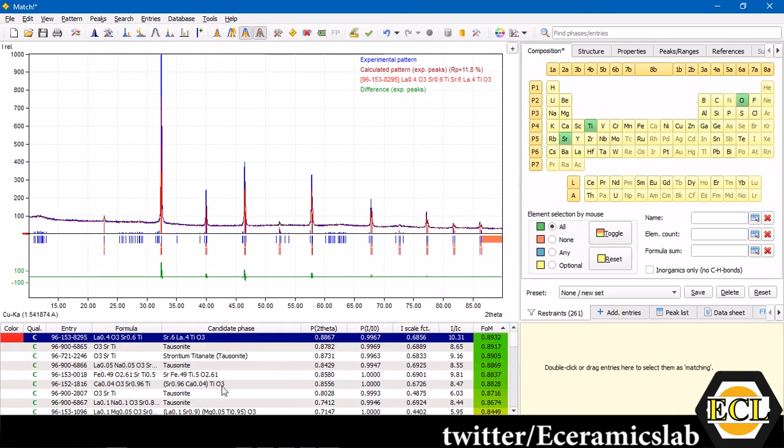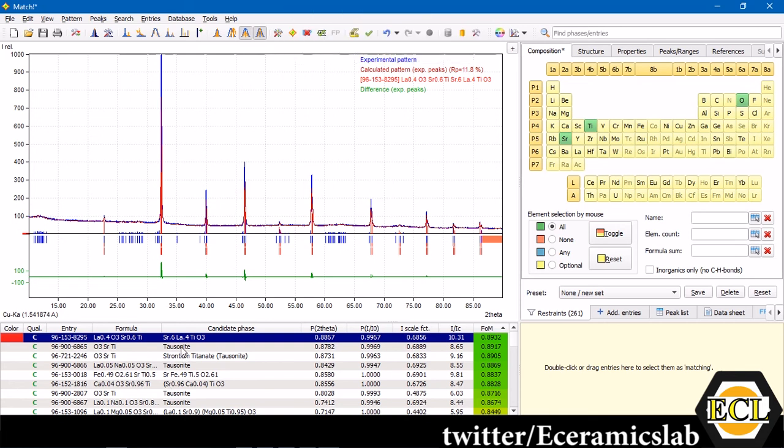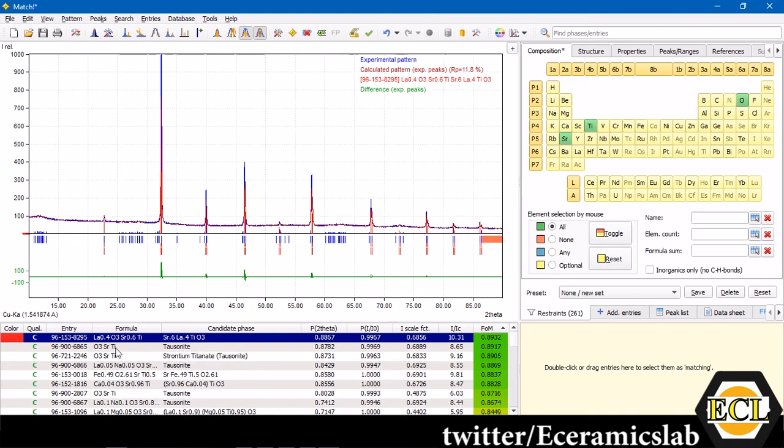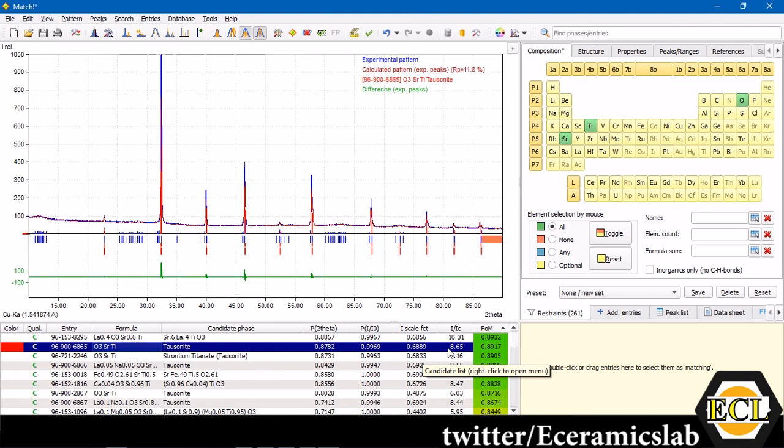It has searched and provided various possibilities in my system. Here you can see the first entry it shows is strontium 0.6, lanthanum 0.4, titanium oxide. We know that we do not have lanthanum in our compound in our sample. We're not going to select it. We'll look over to the next entry, which is exactly matching with our stoichiometry of the compound. We'll select this.